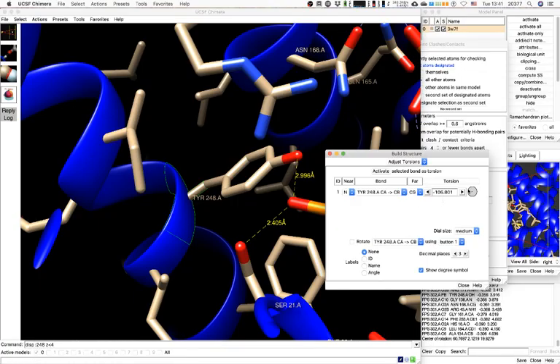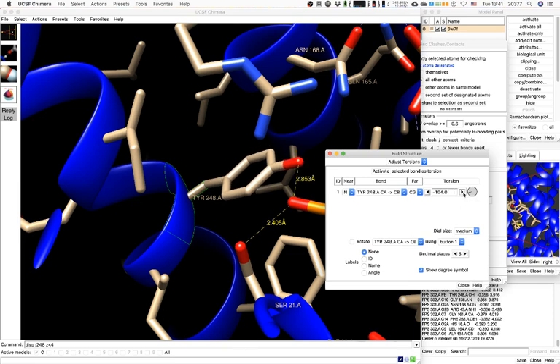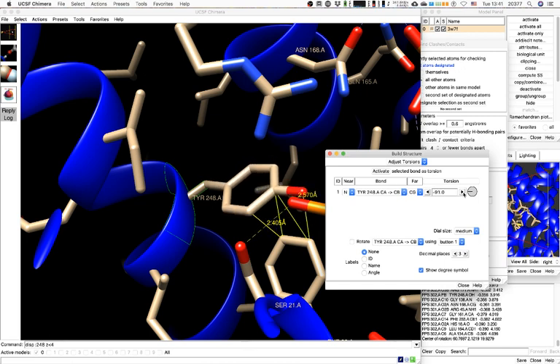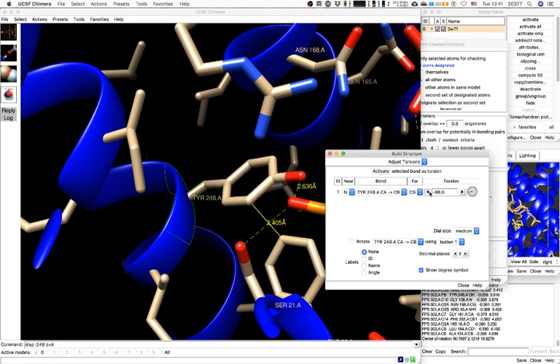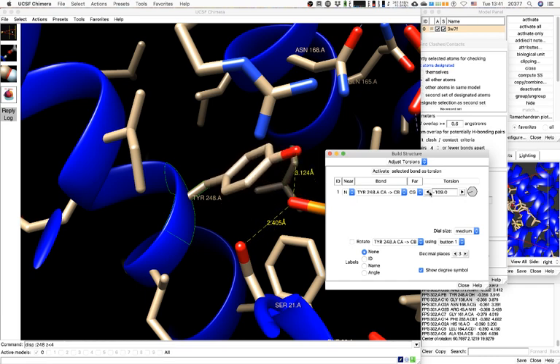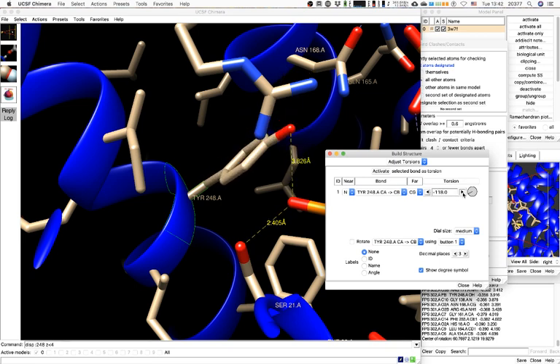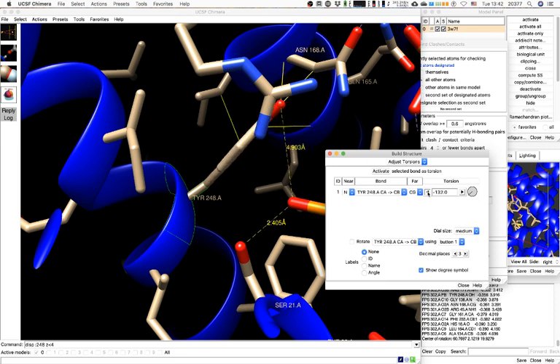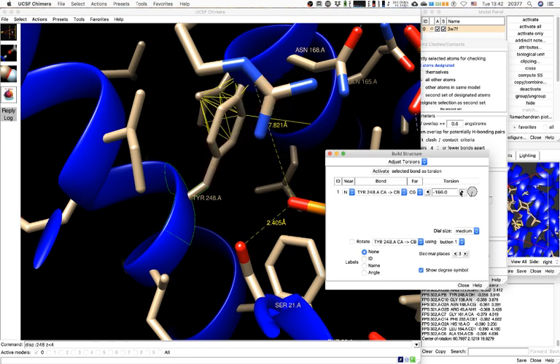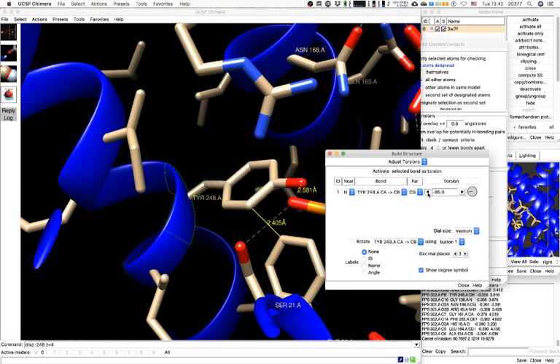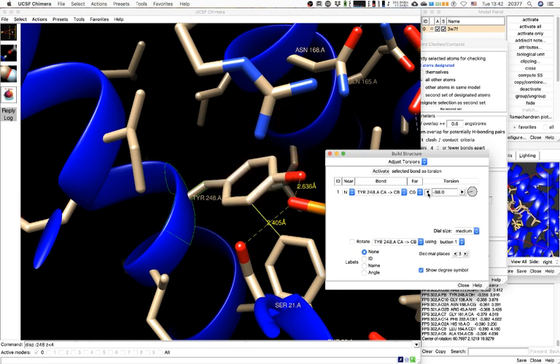Let's use the arrows — there we go, a clash! More clashes. Let's go back. That was very forgiving in that direction. Oh, that's beautiful — a nice orientation.